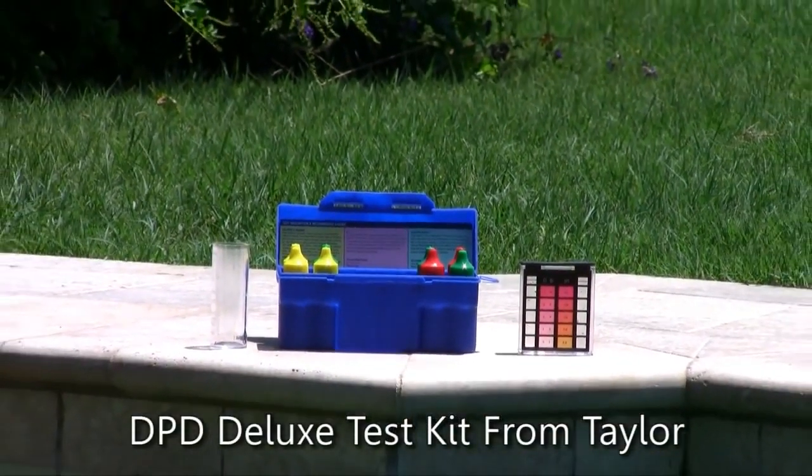We recommend the DPD Deluxe Test Kit from Taylor. It's the perfect test kit for people who want to test their water at home.